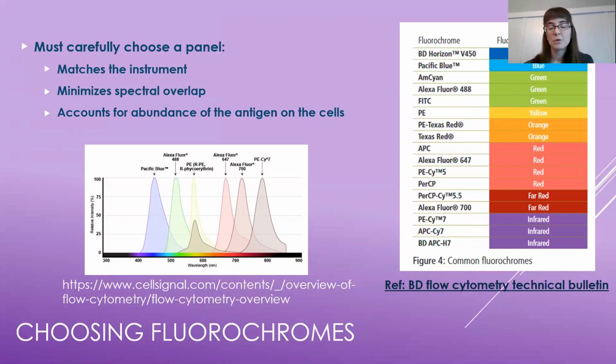And so in general, you want to put your brightest fluorophores on the markers that are the least abundant. That way you're bound to get the most signal. If you put a very bright fluorophore on a highly abundant target, then you get so much signal you might saturate the detector and not be able to resolve other markers that have lower abundance.